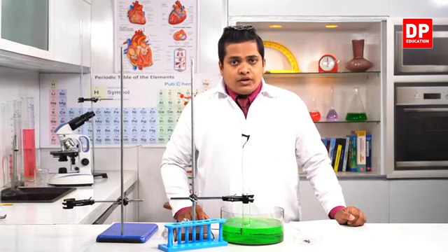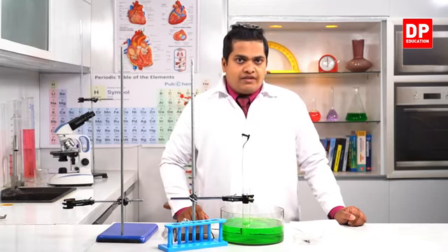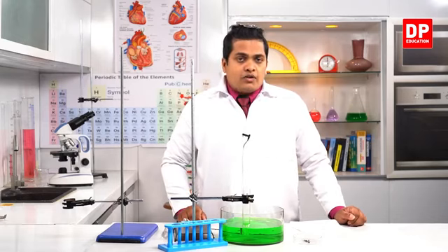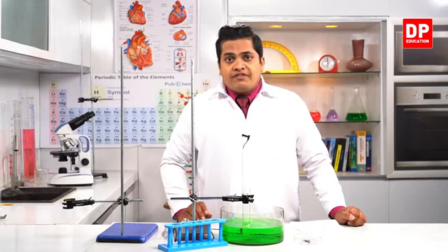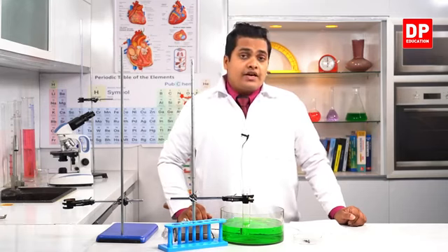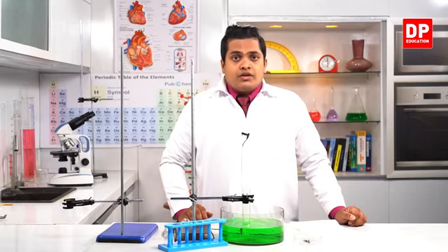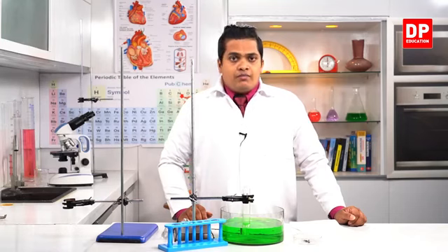So we can conclude that during the rusting of iron powder or iron filings, 1/5 of the air has been absorbed, and we know that 1/5 of the air contains oxygen gas. So finally we can conclude from this activity that oxygen gas is absorbed during rusting. The component of air necessary for rusting is oxygen gas.